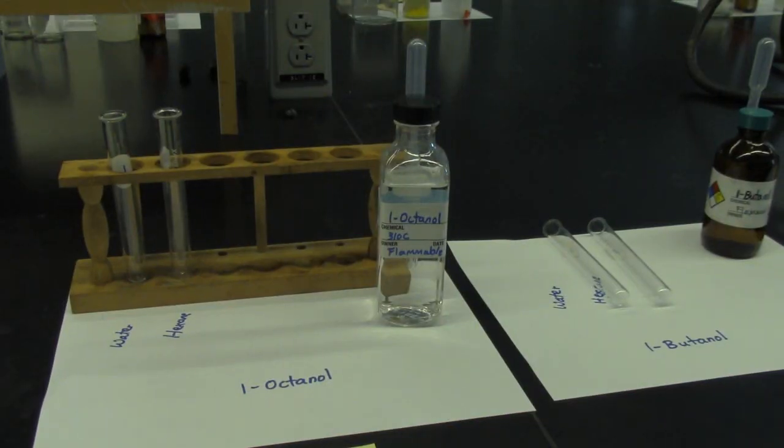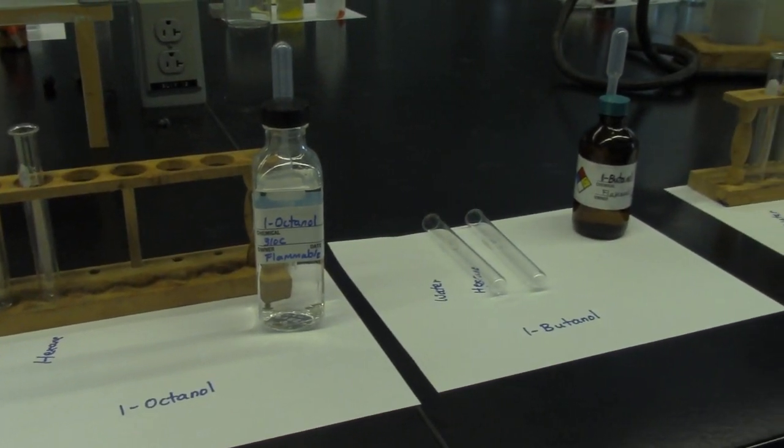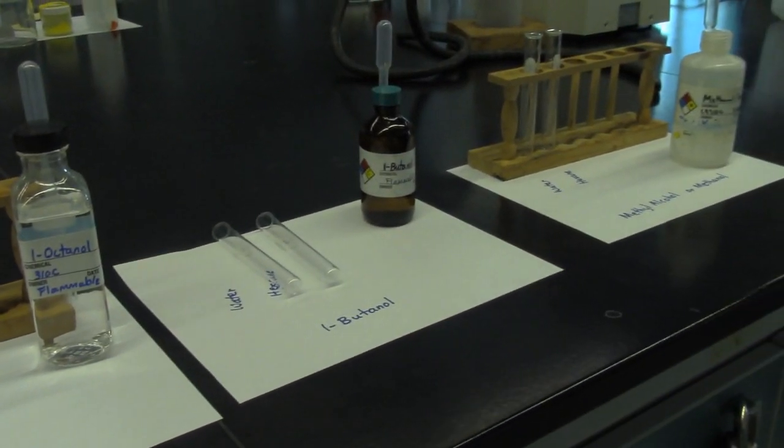So in part B, solubility, we will analyze 3 different alcohols in 2 solvents, water and hexane. We have octanol, butanol, and methanol.